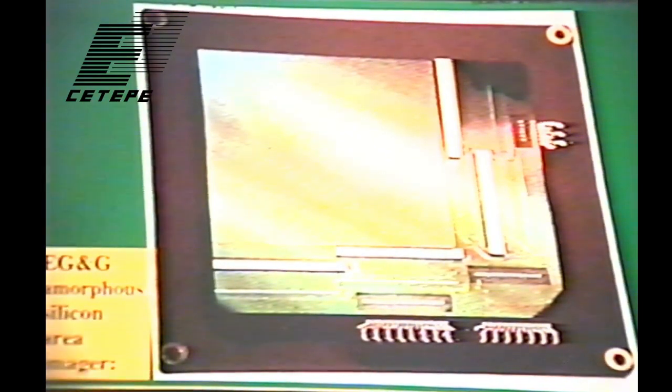Just the camera. I mean, just the camera plus the tapered fiber phosphor. This is an example of a prototype amorphous silicon imager from this company called EG&G. And you can see it's the size of this thing. I'm not sure how big this one is, but these active areas have now gotten as big as 14 by 17 inches. So you can image a whole chest on one of these.